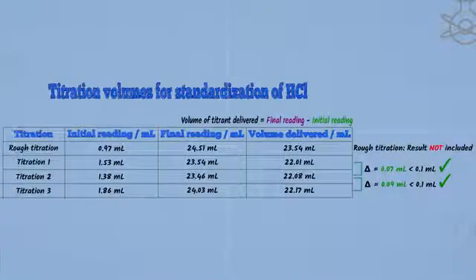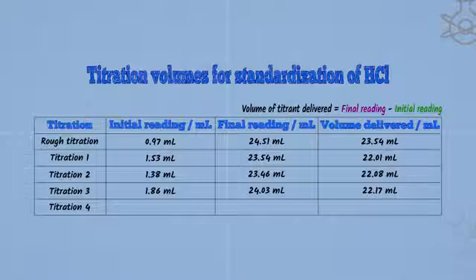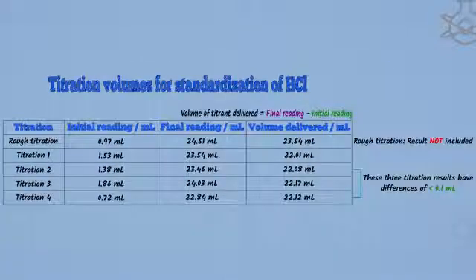To get precise results, your volume of titrant delivered for the 3 non-rough titrations should be within 0.1 milliliter of each other. If this is not the case, additional titrations will be performed to get precise results.